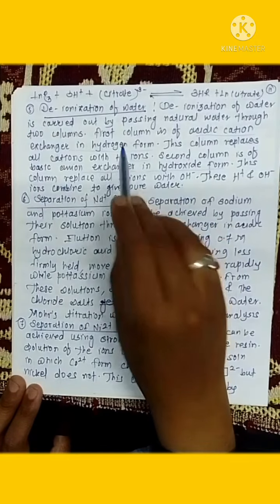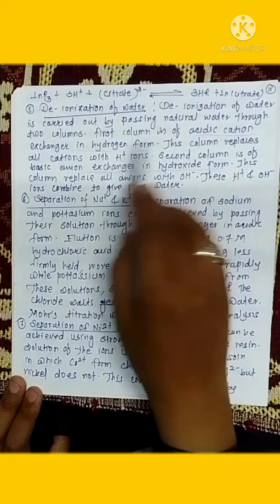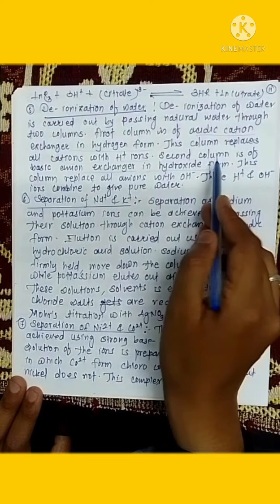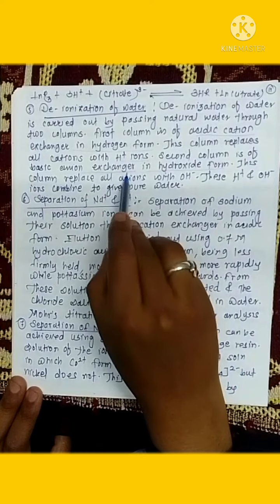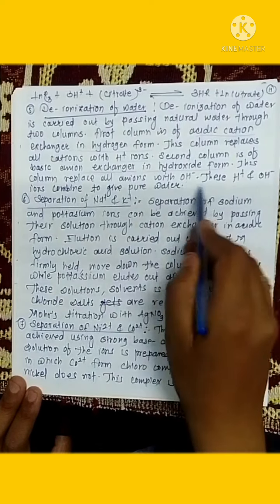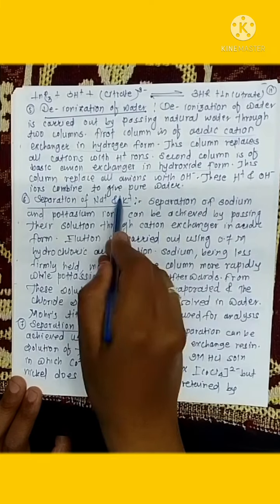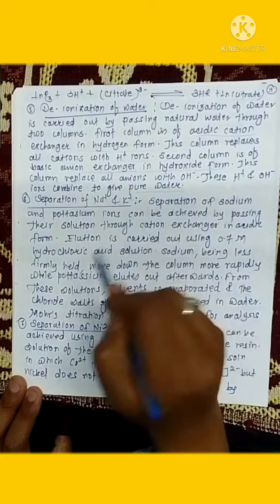It is important: the first column is a cation exchanger in hydrogen form. The second column is a basic anion exchanger in hydroxide form. This column replaces all anions with OH-. These H+ and OH- ions combine to give pure water.